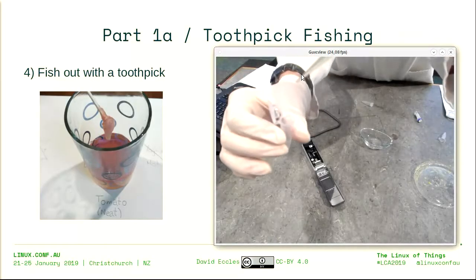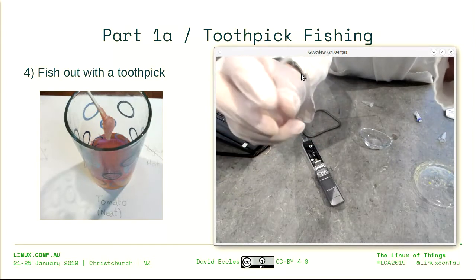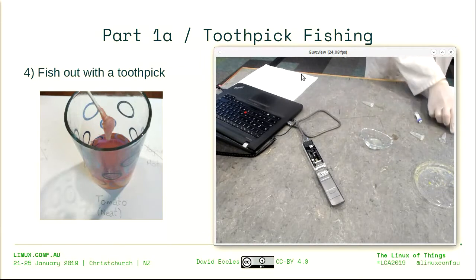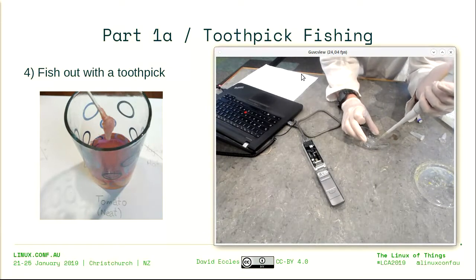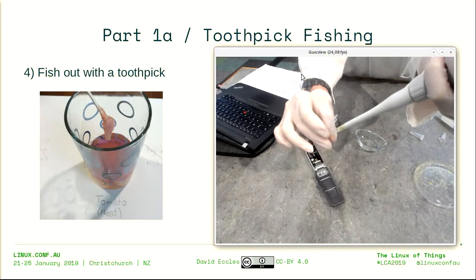This is your typical pipetting shot, just in case someone wants to use this for, I don't know, a movie or something. It's the same DNA, so I can use the same tip. See if I can. There we go.